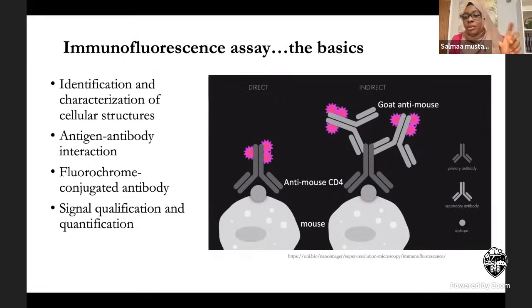I use the DAPI from a manufacturer. You don't have to use that. Just put the DAPI and then that's it. Always remember, yes, I forgot to talk about this. When you're done with your staining and you have your DAPI, your final step, if you're not able to image it that day, you need to keep the cells wrapped in foil as much as possible, so you don't lose your fluorochrome due to exposure to light. Yeah, that's it.